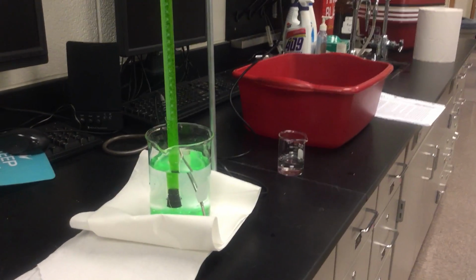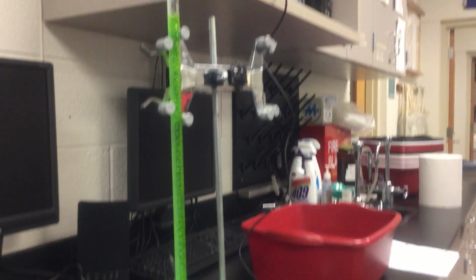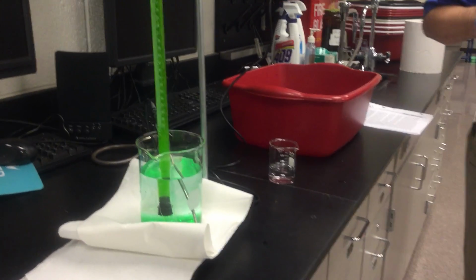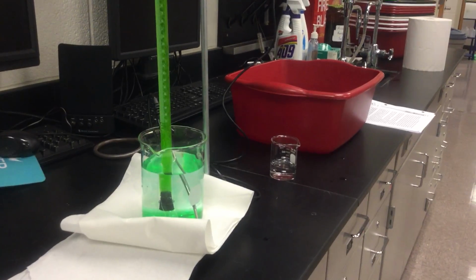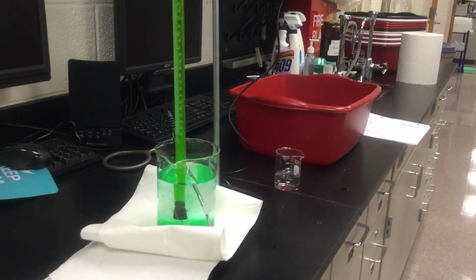Here I have my magnesium strip. Okay, on the lab it says to use in between 2 and 2.5. When I used 2.5 yesterday, it went to 48 milliliters. I was sitting there wondering, boy, am I going to take it out of the bottom there? Because I didn't want to do that. So I was getting worried.